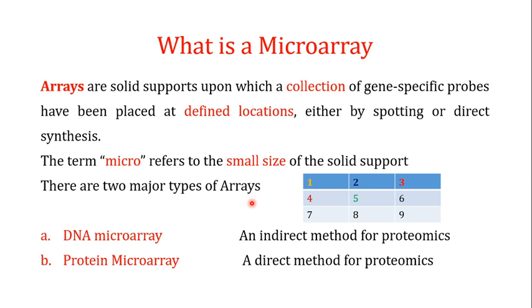Now the arrays actually come in two flavors. One is known as the DNA microarray, which is actually an indirect method for the study of proteomics, and the other one is the protein microarray, which is actually a direct method for the study of proteomics.